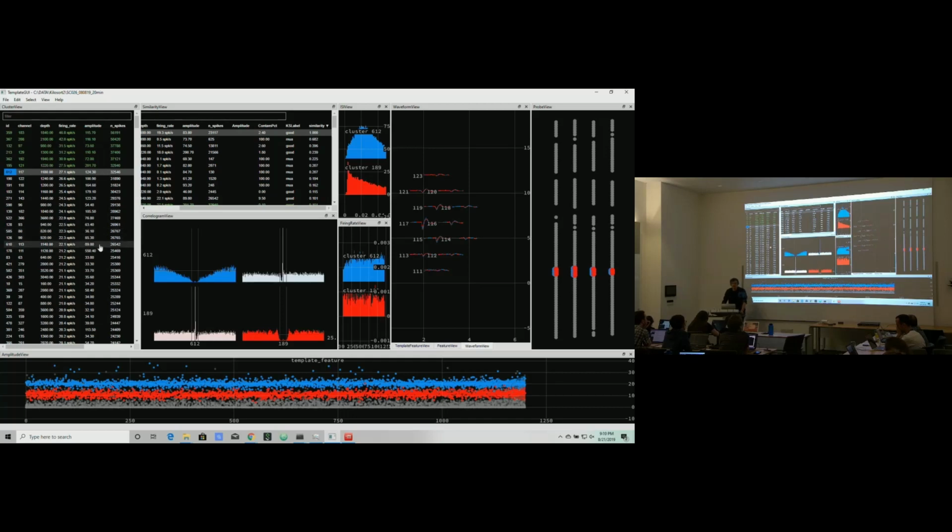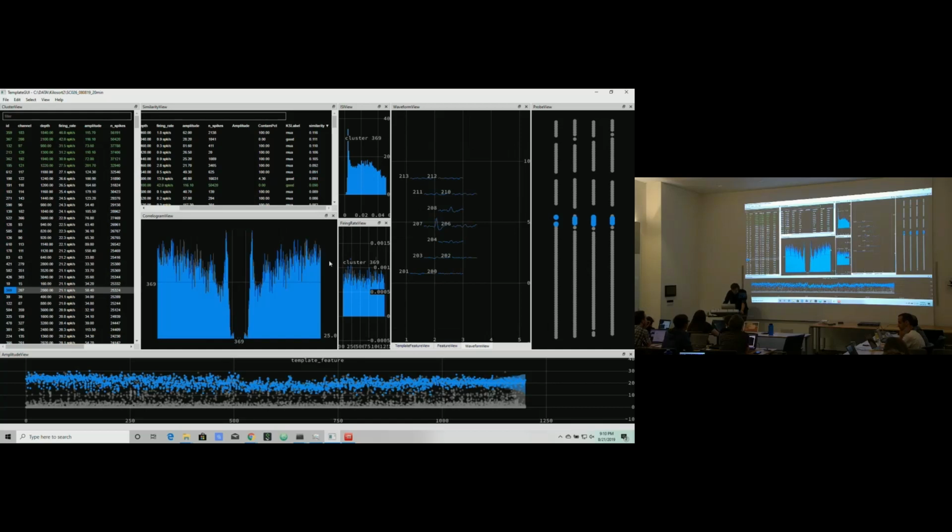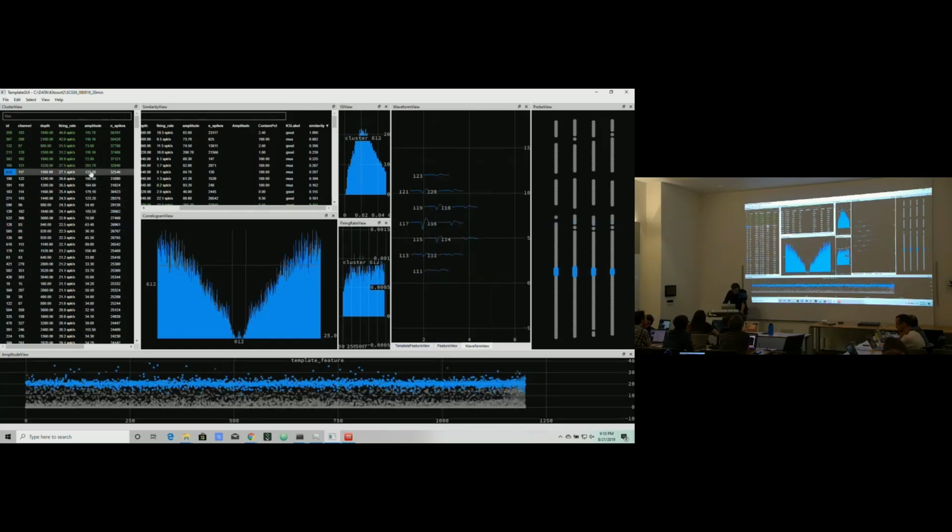Now, Susu has given us a really good data set, so we don't have a lot of hard cases. Wait, was that an example of two cells that were connected? This one?